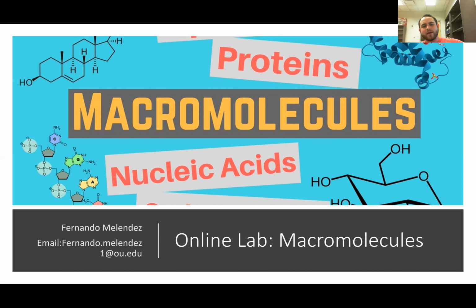This topic is going to be the macromolecules one. It's a very interesting topic. Students always seem to enjoy this topic for some reason. It usually involves a lot of chemical testing and a lot of color changes. So it's a very visual lab and students seem to really enjoy it. So I hope you guys like it.